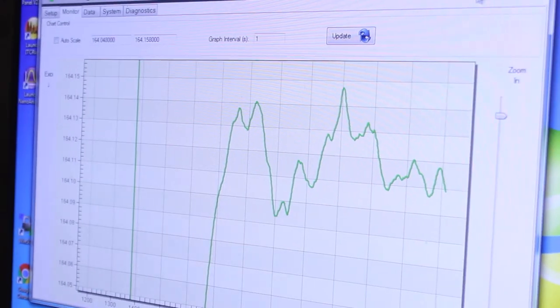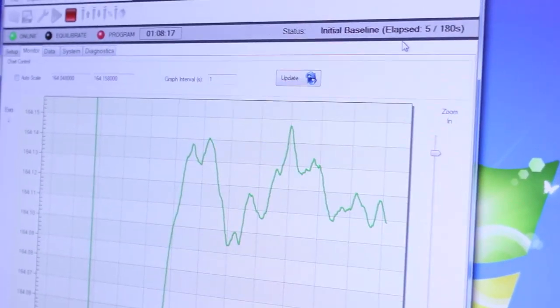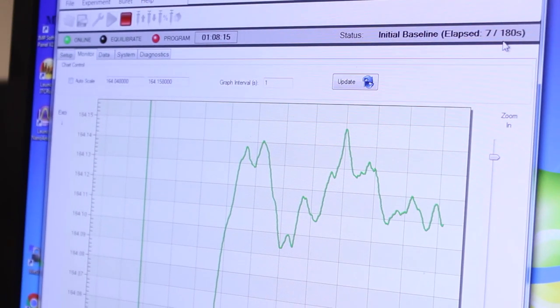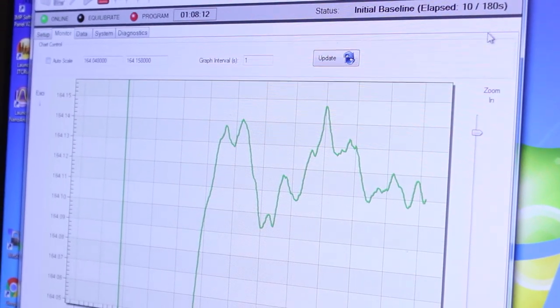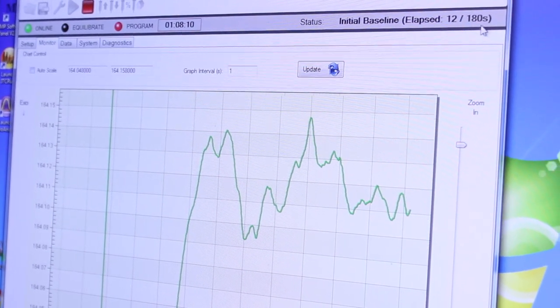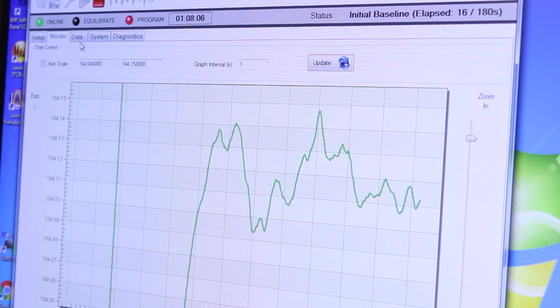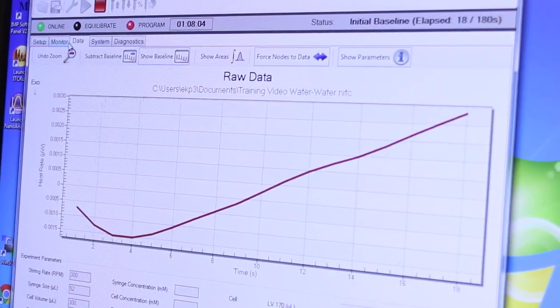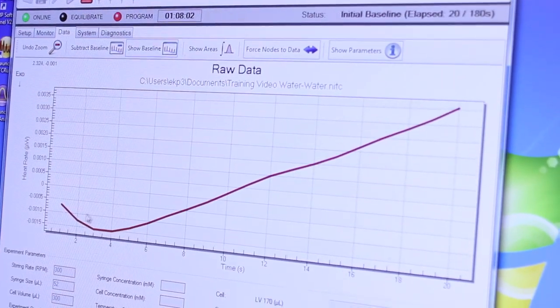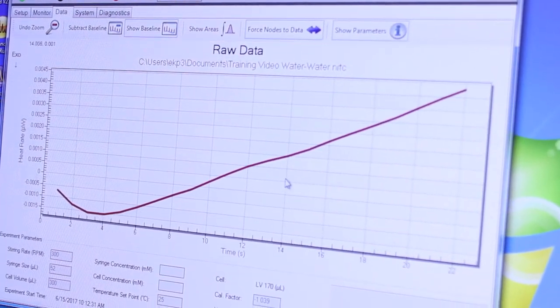At this point it will now start collecting the initial baseline so this is after the auto calibration is going to collect another period of time which will be the starting baseline for your data set.